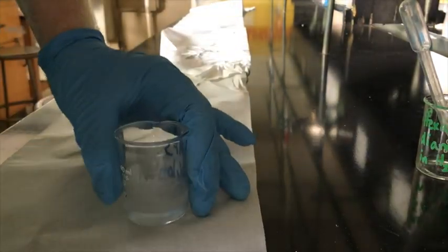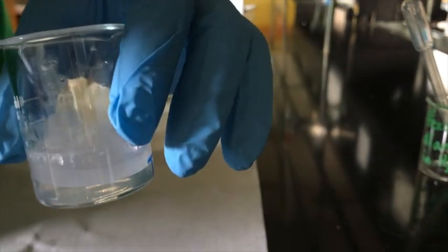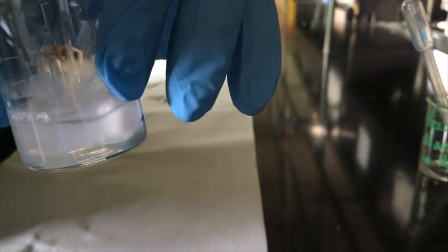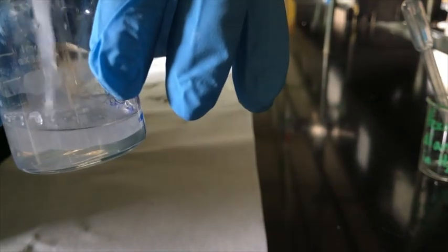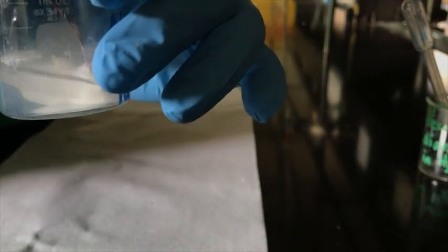This one again, this one's pretty cool. So if I bring it up close, make sure it's focused, and then I swirl it around, I can get a big glob, huh? Look at that guy. Like snot. Jellyfish or something, huh? Okay, so we've made some nylon.